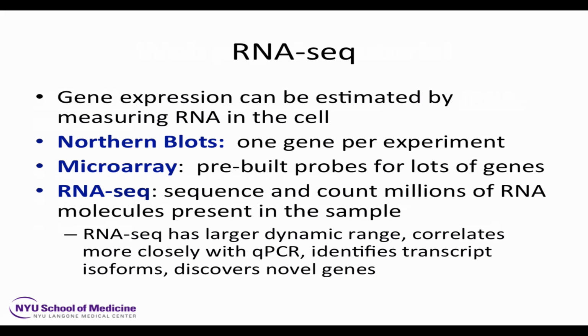Then you did some type of differential measurement to measure the difference in abundance of the target gene in each of your samples. RNA-Seq measures the abundance of gene expression by actually counting molecules of RNA in each sample. The counting is by sampling individual molecules from a library.